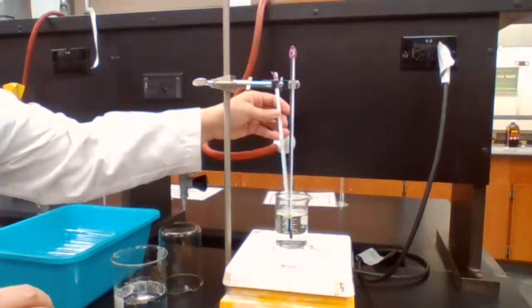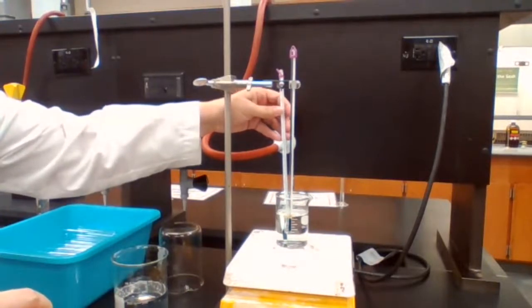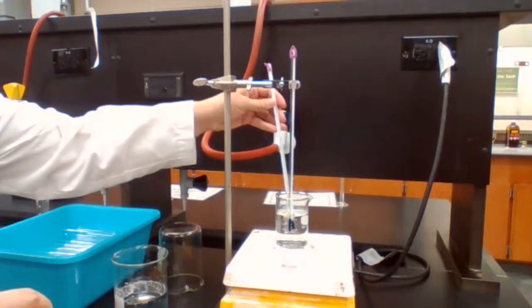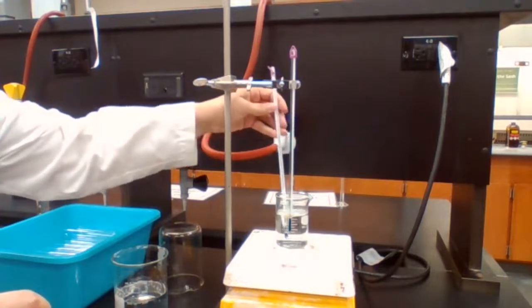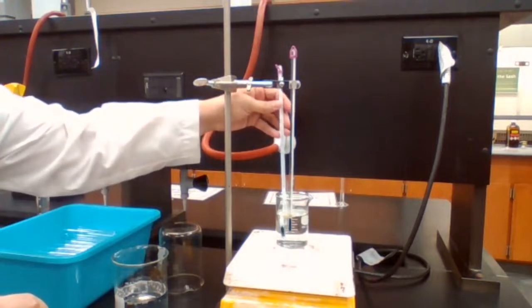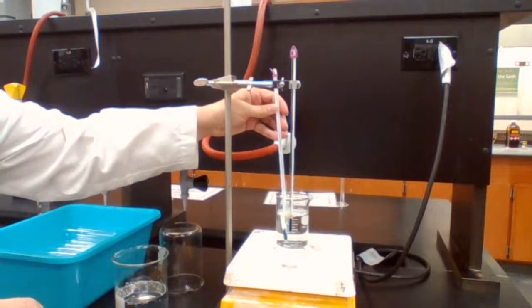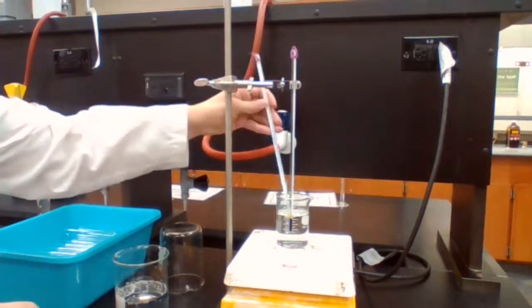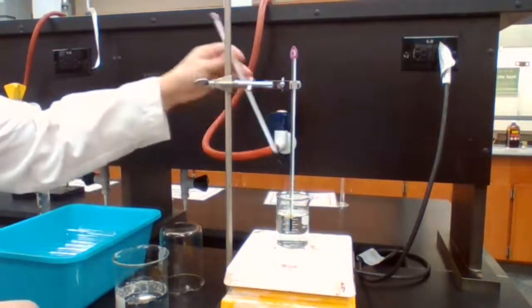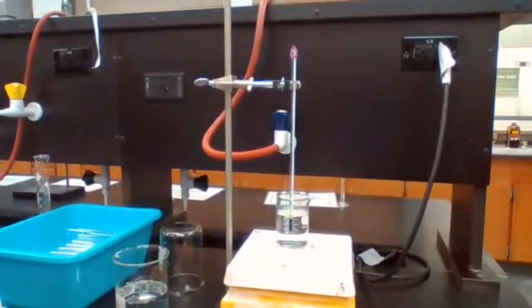I'm just waiting. I just want to make sure both thermometers are showing the same number, because if your thermometer is not showing the right number, you're not going to get the right answer. Okay, it looks like my thermometer is working and it's showing the same number as the other thermometer. So we just wait until we see the bubbles.